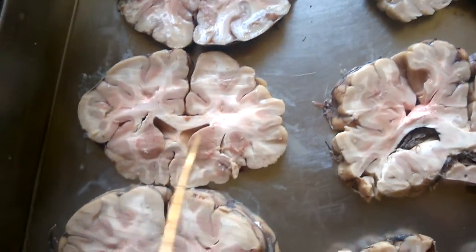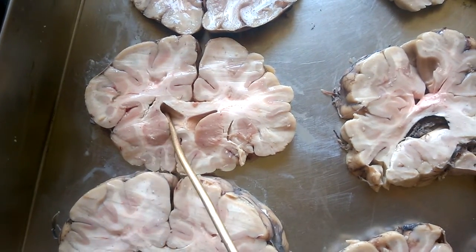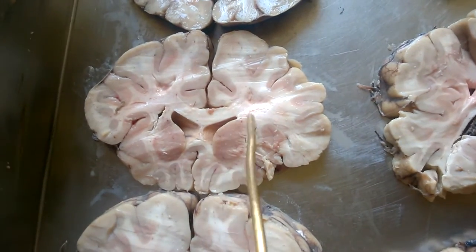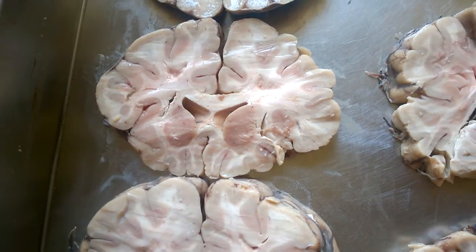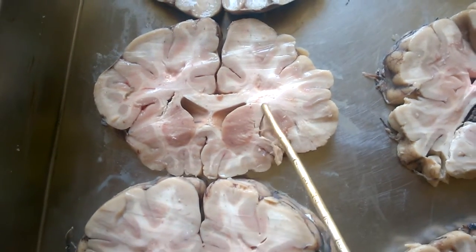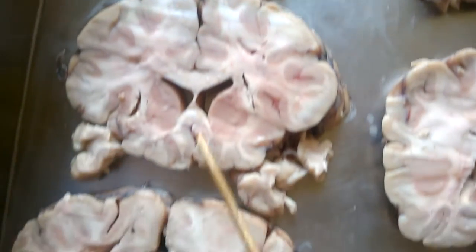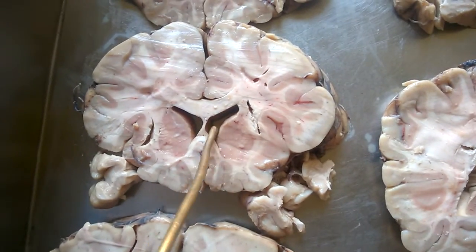backwards we can see this nucleus that is almost pushing into the anterior horn of the lateral ventricle. That is the caudate nucleus. The caudate nucleus will always be in relation to the lateral ventricles. And this is the internal capsule, the anterior limb of the internal capsule. Then going back, here also we can see the septum pellucidum.